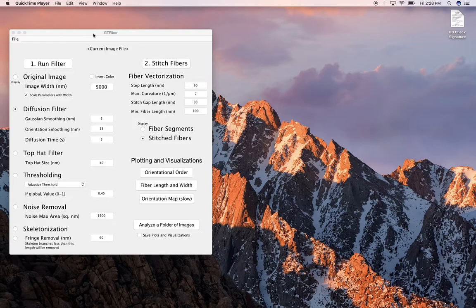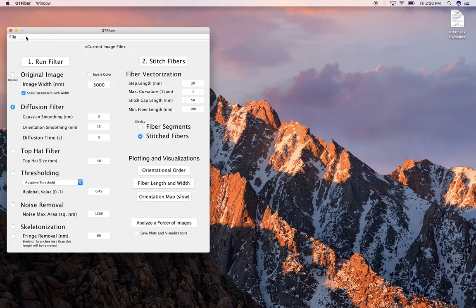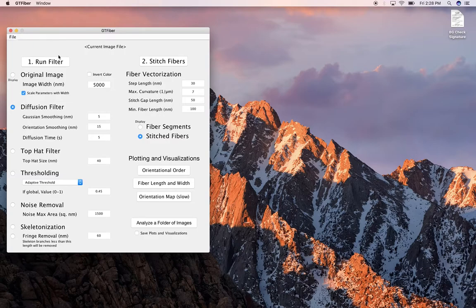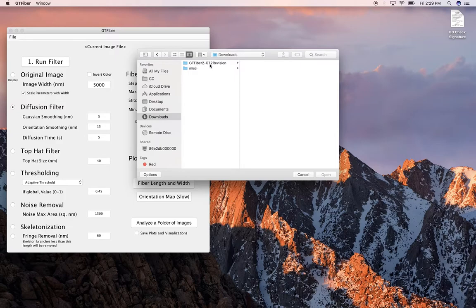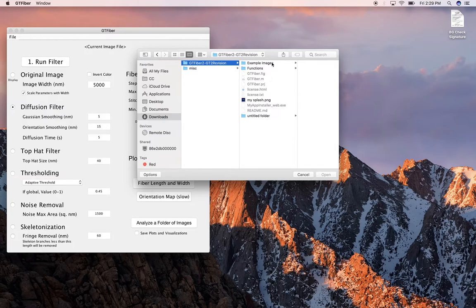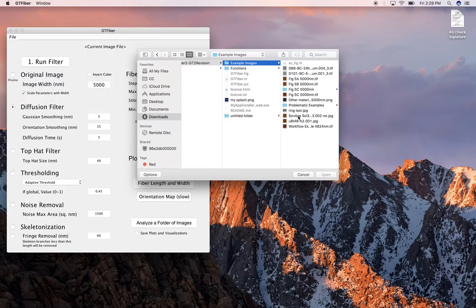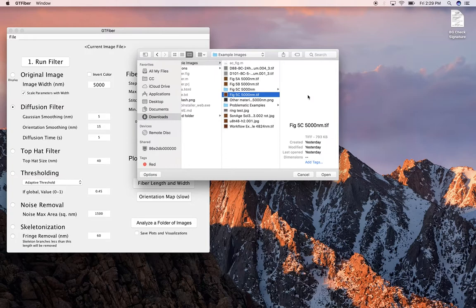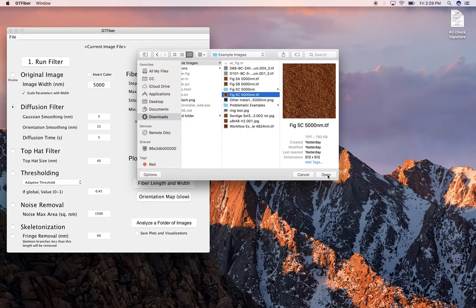On Mac OS, what we're gonna do is start by opening an image. So let's go file, load image, that's the only thing you can do under file. If you downloaded the github repository, which I did, I downloaded it to my downloads folder, and here's gtfiber2-gt2 revision, and there are some example images. Let's use figure 5c. This one is a good example for a lot of things. So we're gonna open this one up. It's 512 by 512 dot tiff.